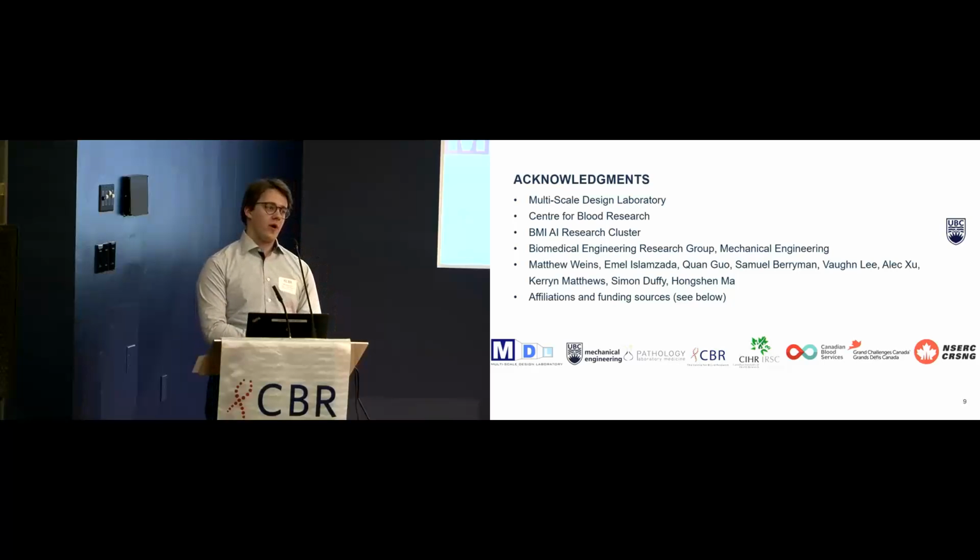And right now, the main bottleneck in applying this is in the data processing side. It takes a lot of time to take the data and segment the images into single cell images for use in the model, and it takes hours or sometimes days to manually audit that process to make sure we have quality data.